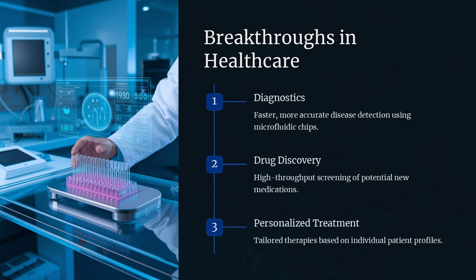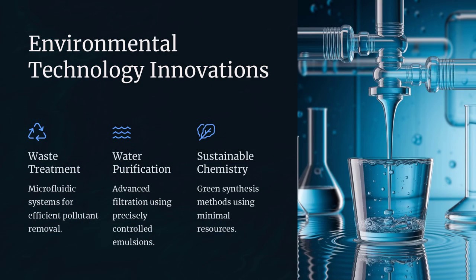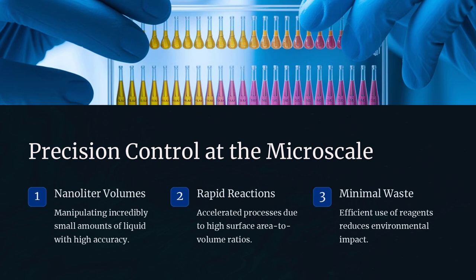Imagine designing a custom-built racetrack where every curve, straightaway, and pit stop is meticulously planned to maximize performance. This is exactly what happens at the microscale in these devices. For example, researchers have developed channels with gradual curves and smooth transitions that minimize turbulence, ensuring that droplets are not subjected to disruptive forces that could cause them to coalesce or break apart.